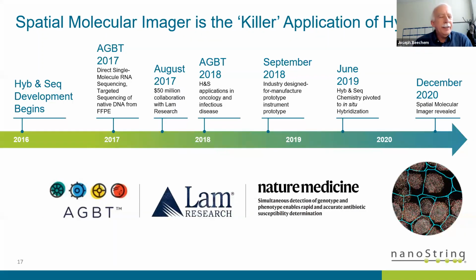When we were developing this, it actually started as a different kind of project. It started as a project where I was inventing and developing ultra small cyclic optical barcodes that do sequencing. We developed a 20 nanometer sized optical barcode that will change colors as I put different hybridization reagents on there. It's 4 different colors, so you encode information like that, and how many bits of information is how many cycle events you want to have and all the light-dark patterns.